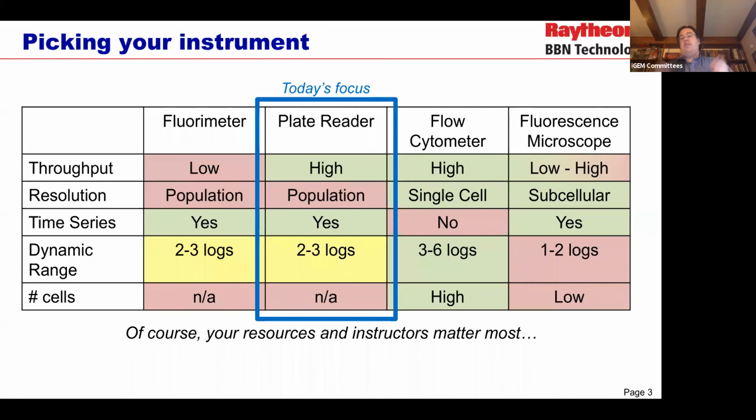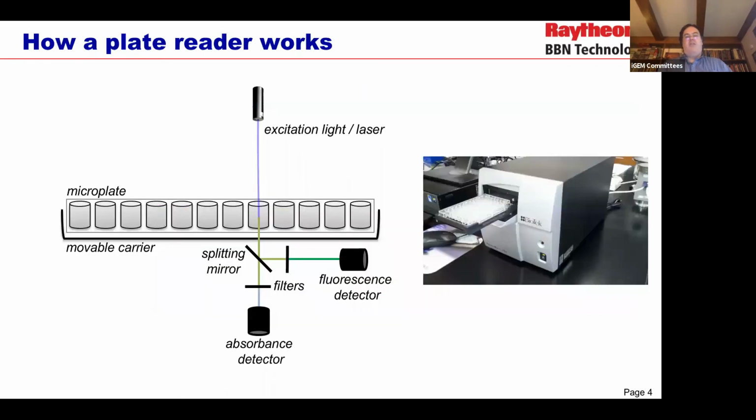But of course, the thing that matters most is not what would be the best instrument you could possibly use, but the instruments that you actually have and the ones that your instructors may be able to best help you use. It's much better to have an expert who can really help you get the most out of an instrument that's not quite so good over badly using an instrument that you're barely allowed to touch. Well, let's talk about plate readers. Let's talk about how a plate reader works.